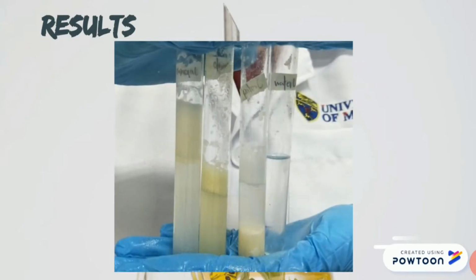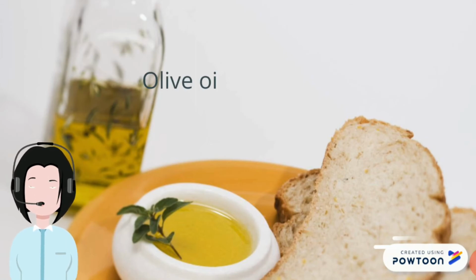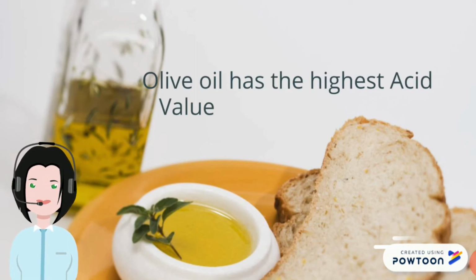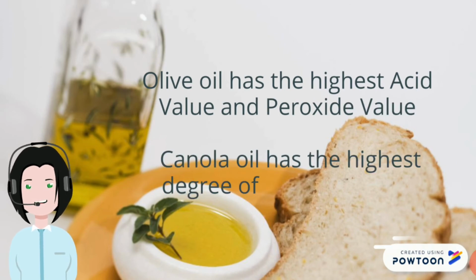Based on the result, the degree of saponification was highest in canola oil, followed by palm oil, and the lowest was olive oil. It indicates that canola oil has shorter chains of fatty acid, while olive oil has longer chains of fatty acids. Therefore, we can conclude that olive oil has the highest acid value and peroxide value, while canola oil has the highest degree of saponification.